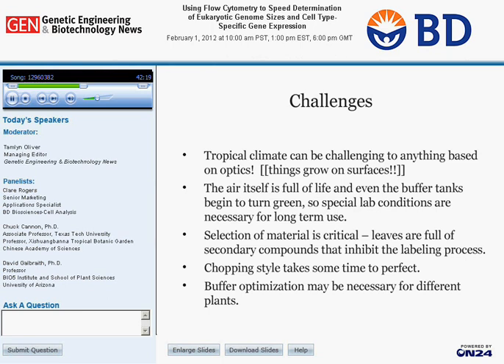So say there's a second point there that, you know, the air is really full of life. There's lots of spores. Things can infect the buffers in the tanks, and so we've had buffers turn green. So you really do have to take a few extra precautions to make sure the machine is clean and protected. And if you can put it in a special room where other people are not coming in and out, we've actually had some problem with people working with soils, and the spores were coming out of the soil samples and infecting our machine. And again, the selection of material is very critical.